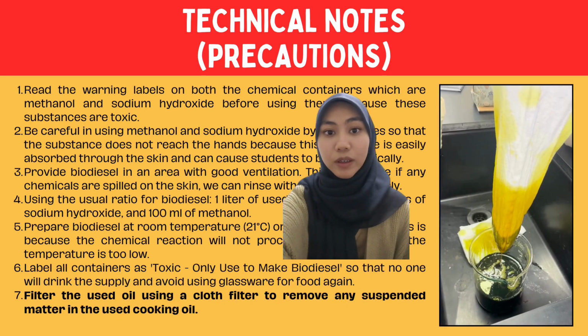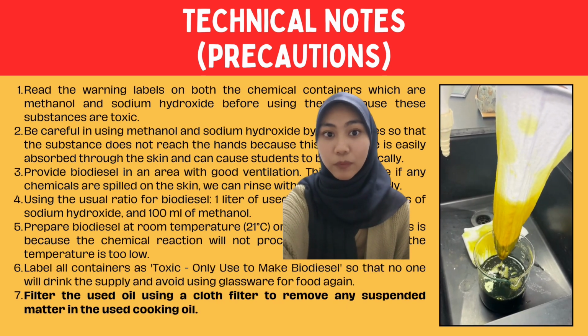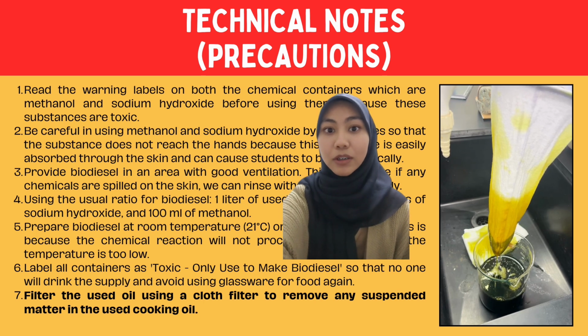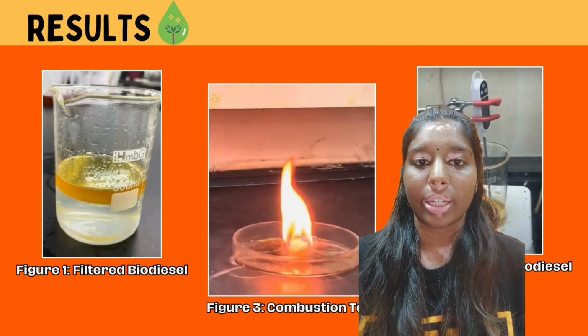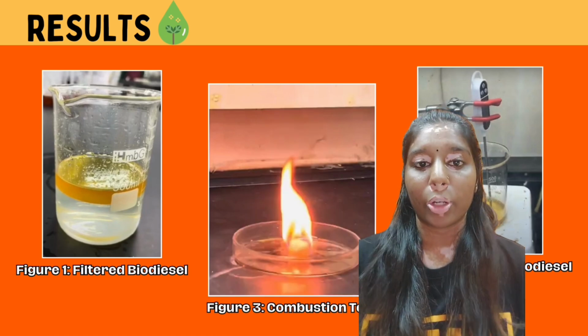And lastly, filter the used oil using a cloth filter to remove any suspended matter in the used cooking oil. So I'll be explaining about the results. As we can see, the result was successfully obtained.